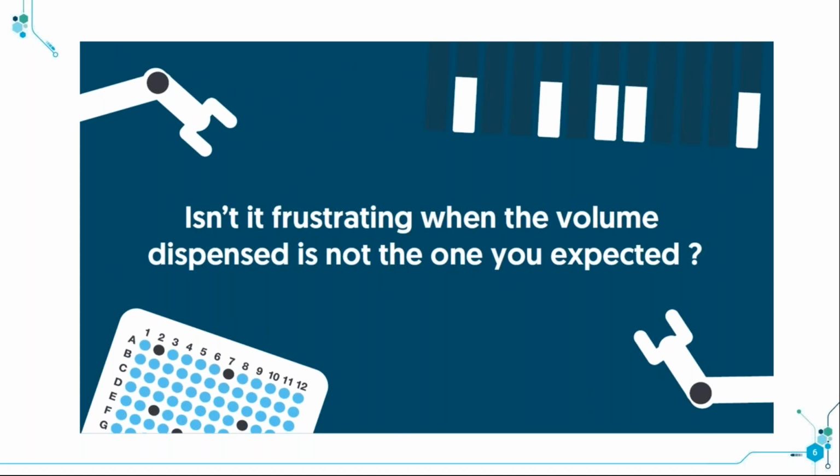You know that there are some kits available to calibrate the liquid handling process, but they give you an evaluation at a given time. There is really nothing on the market to track the performance of your liquid handling operations. And this is the main question we want to address with this tool.